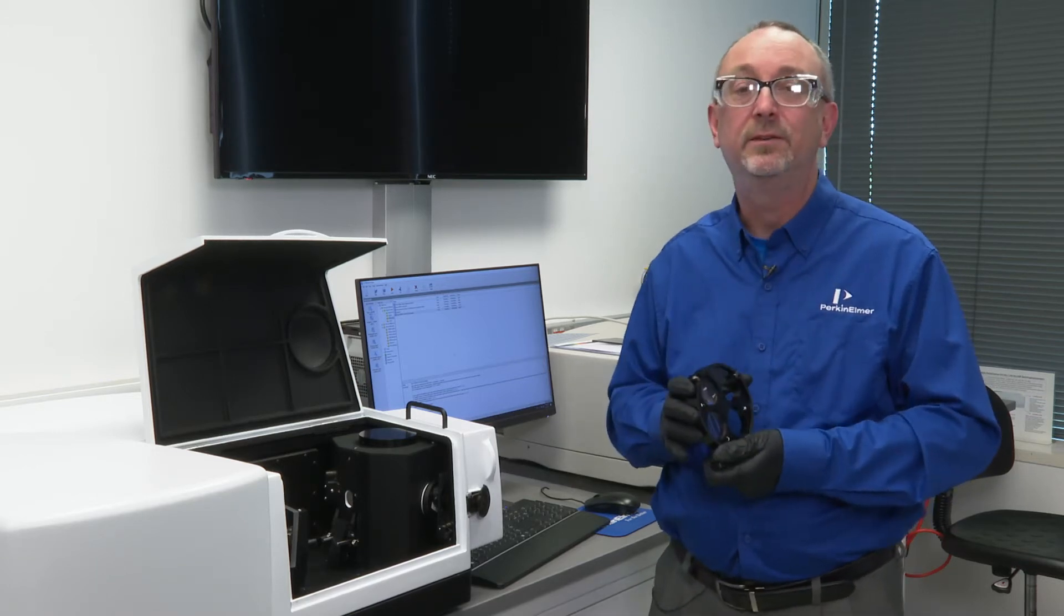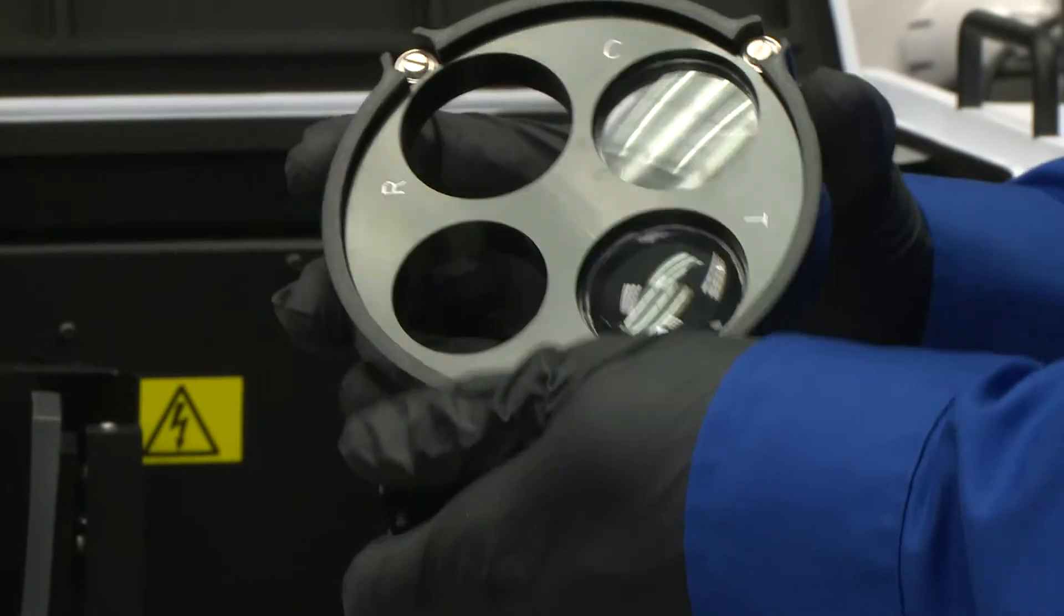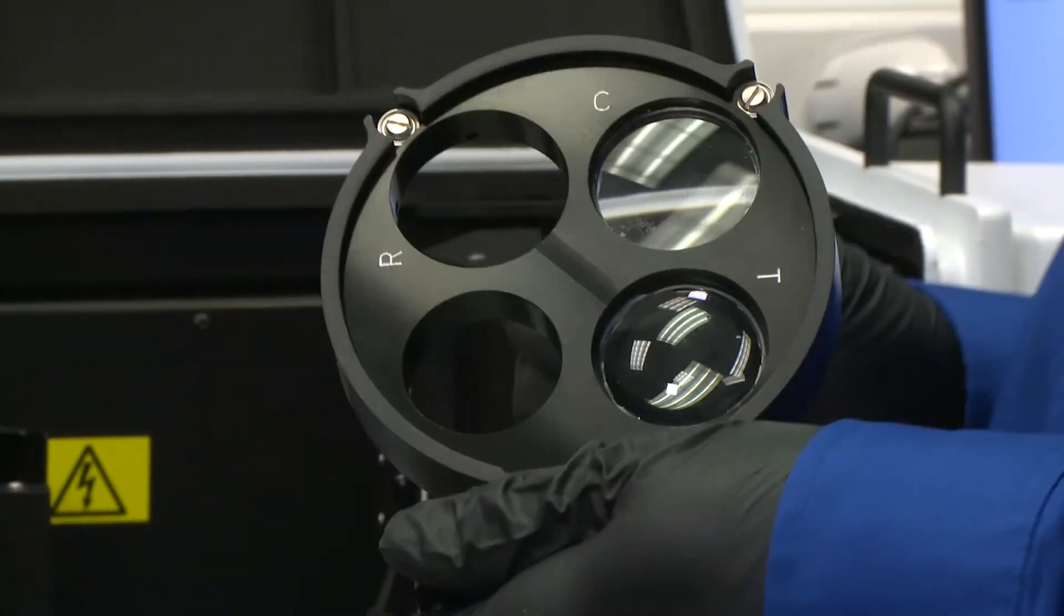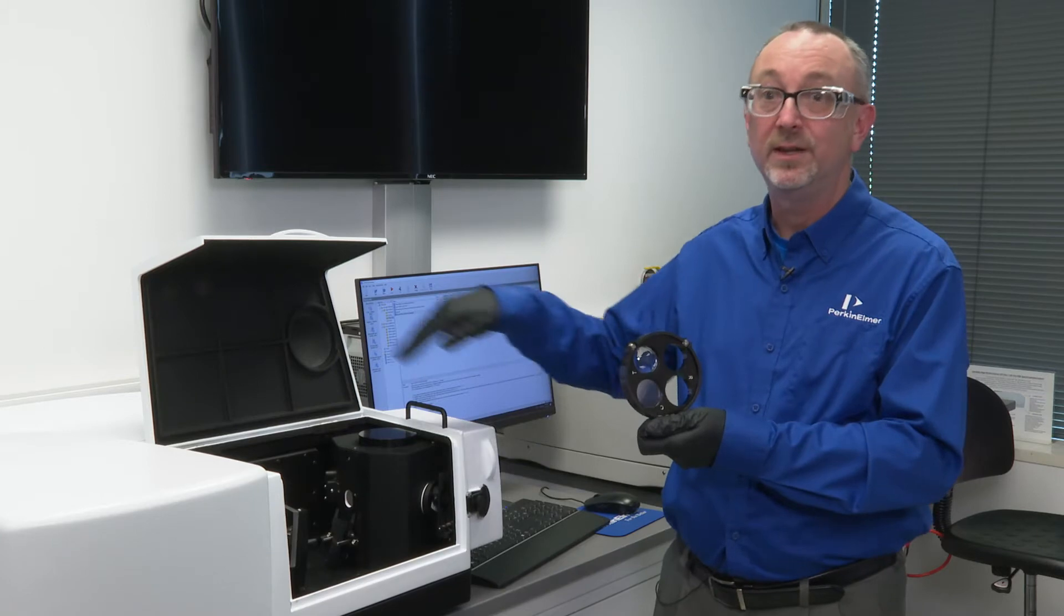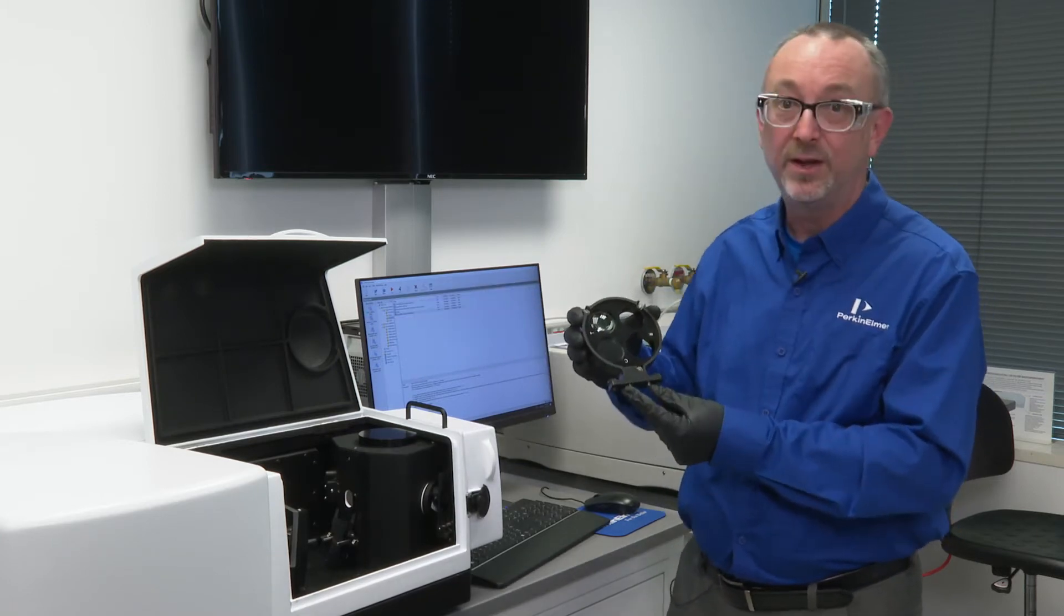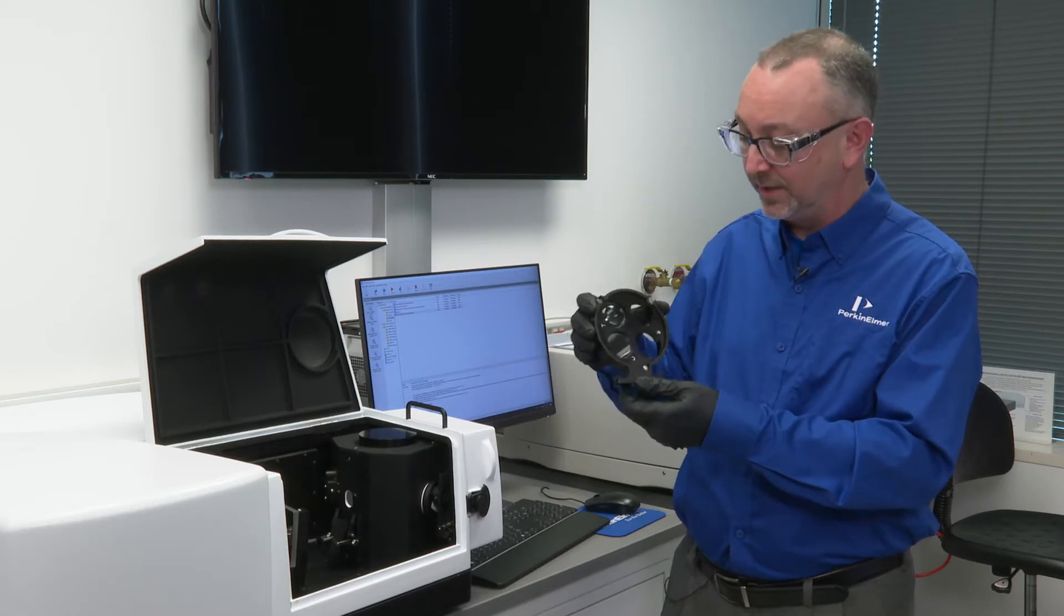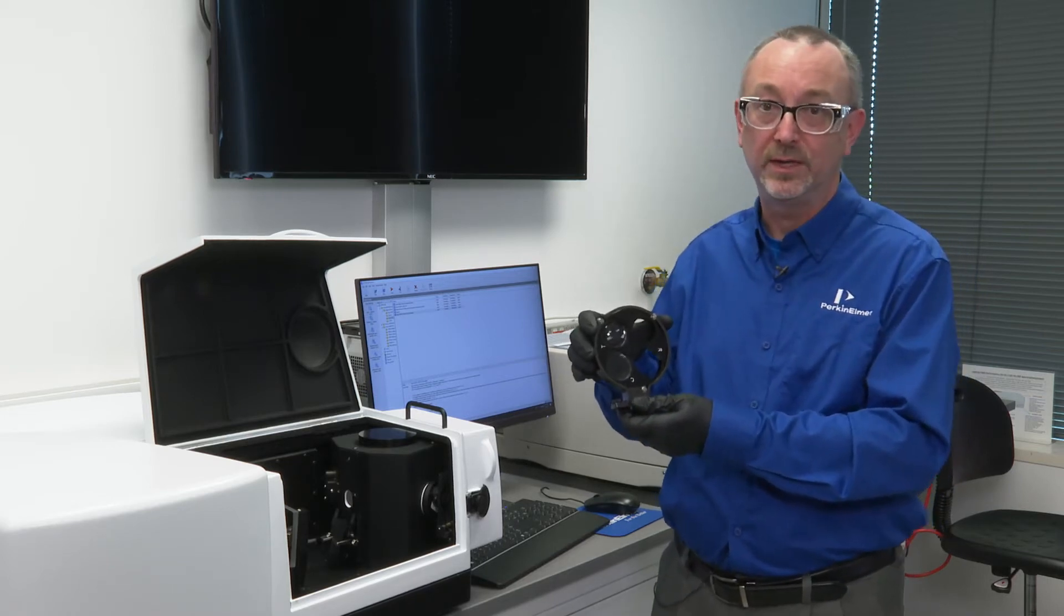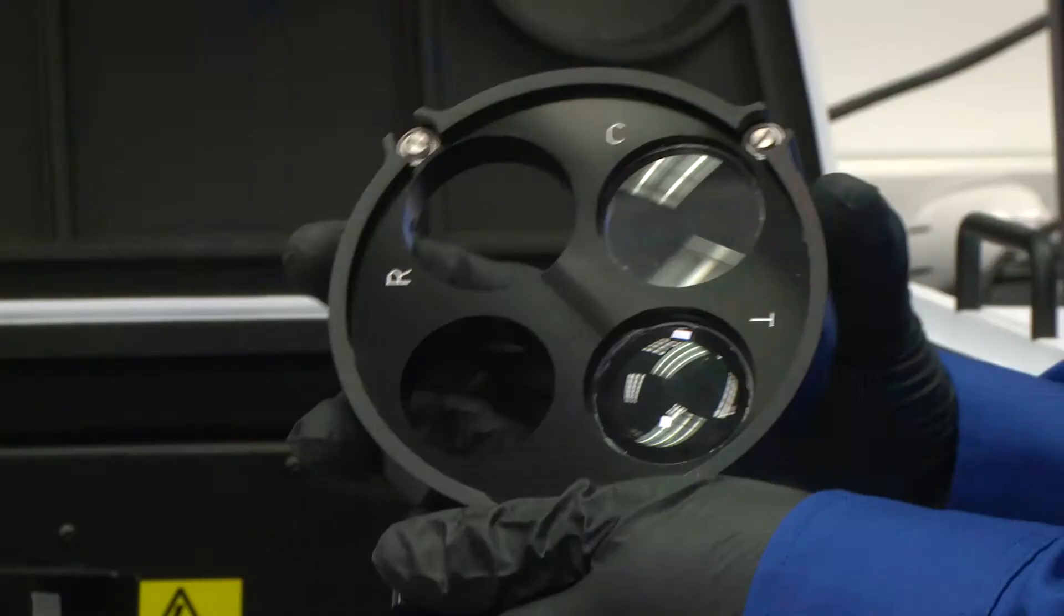So that means we need to focus the beam appropriately. This is a small spot kit and this resides inside the sphere detector compartment area. And there are two guide pins and two set screws here that allow you to secure the small spot kit into the area before the integrating sphere.